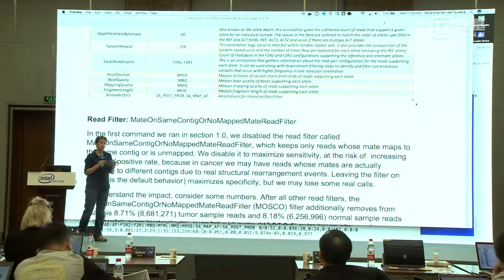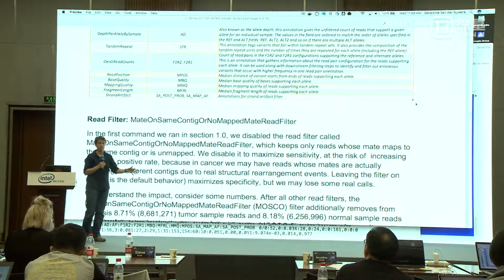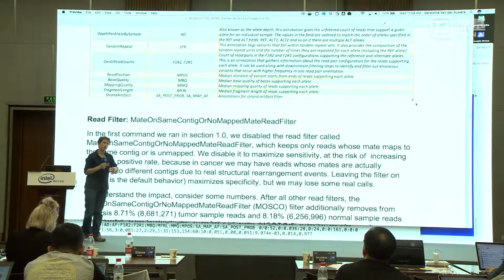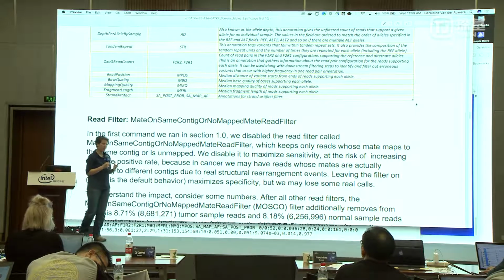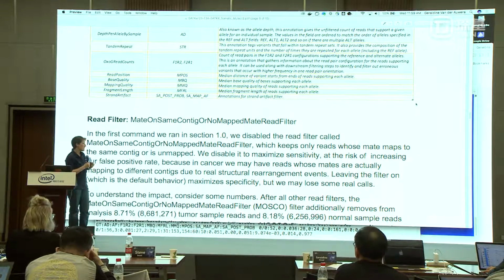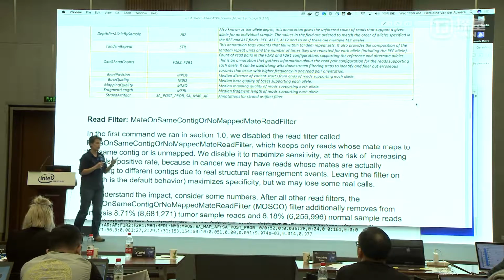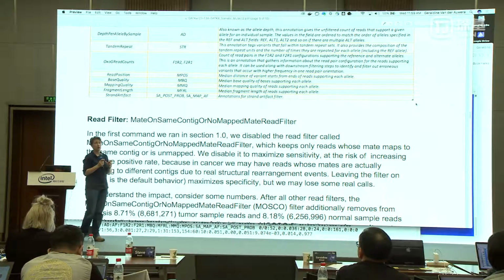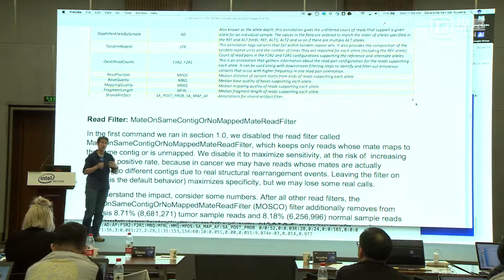In a germline context, when we see reads like that, we assume that there's just a mapping issue. Something's in the wrong place, so they're not informative, and we're just going to ignore them. However, there's some discussion, and one of my team members is quite adamant about this, that this filter is potentially eliminating reads that are legitimately mapping with a mate in a different place or different orientation because of some other event, some other variation in the genome.